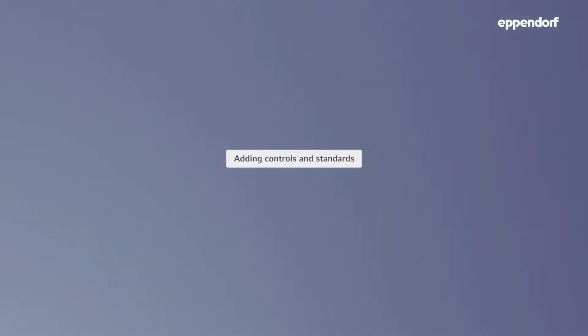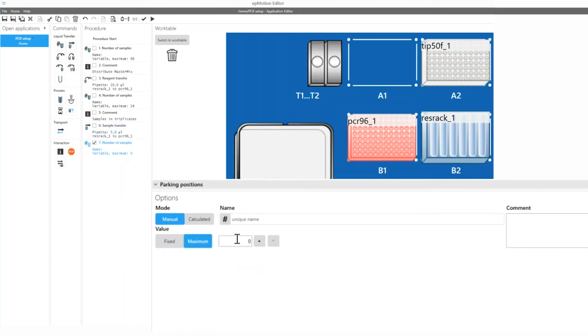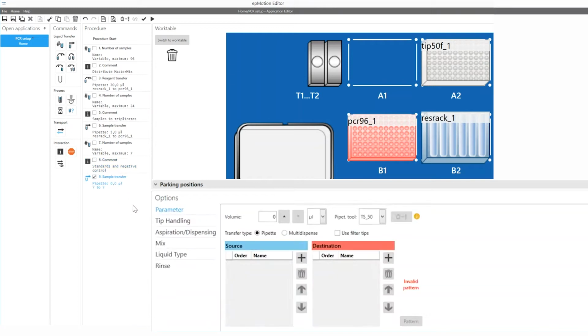Finally, standards and controls can be added to the PCR plate. In this example, 6 standards plus 1 negative control are used. A sample transfer command is again conducted to perform the liquid transfer from the source vessels to the desired vessels of the PCR plate.